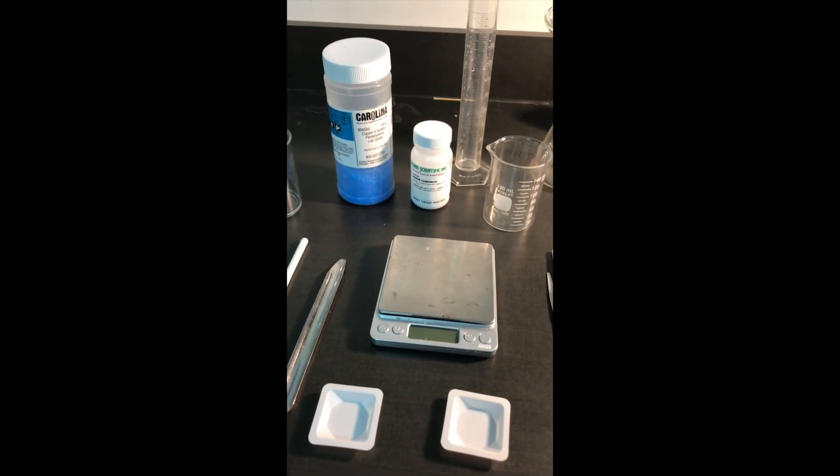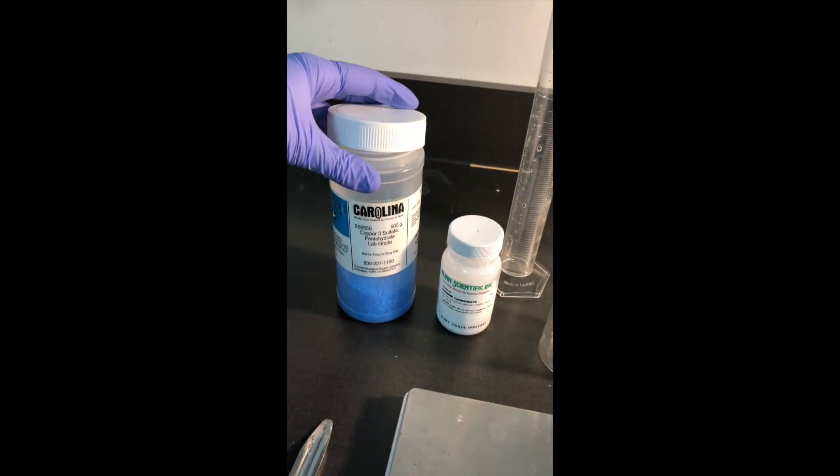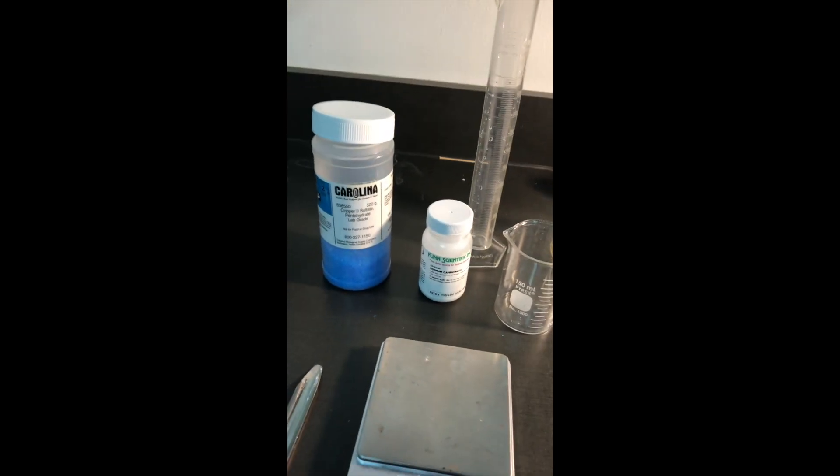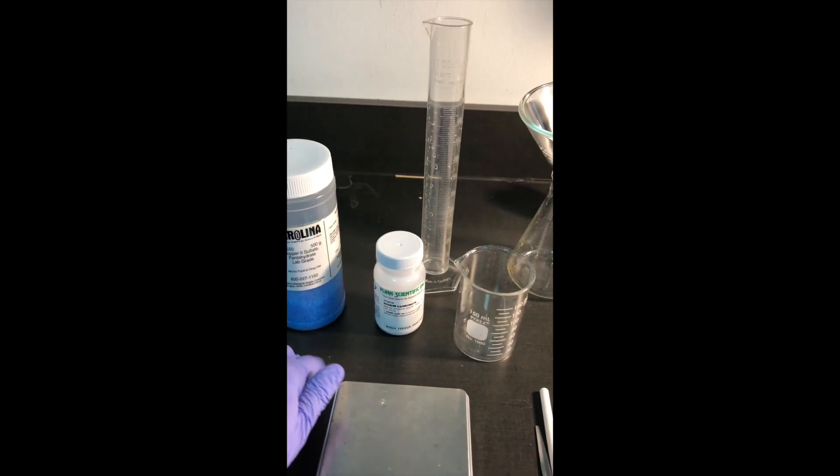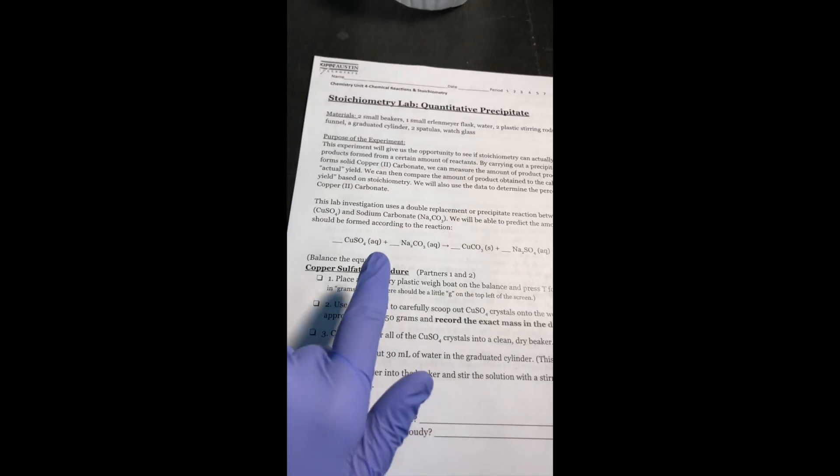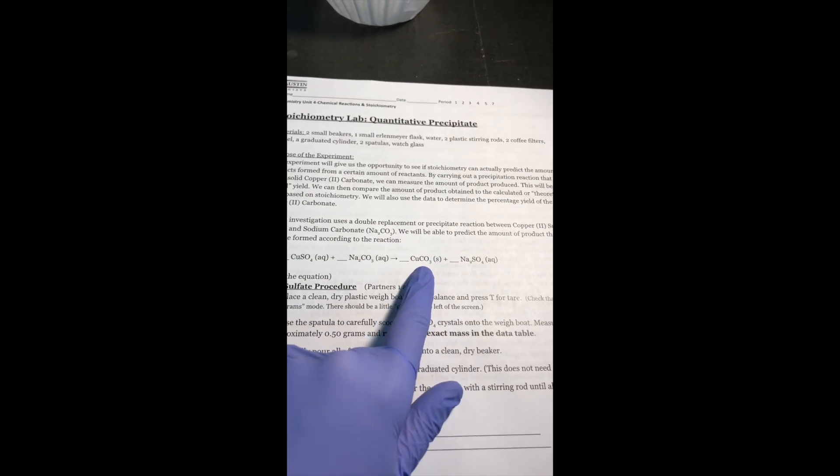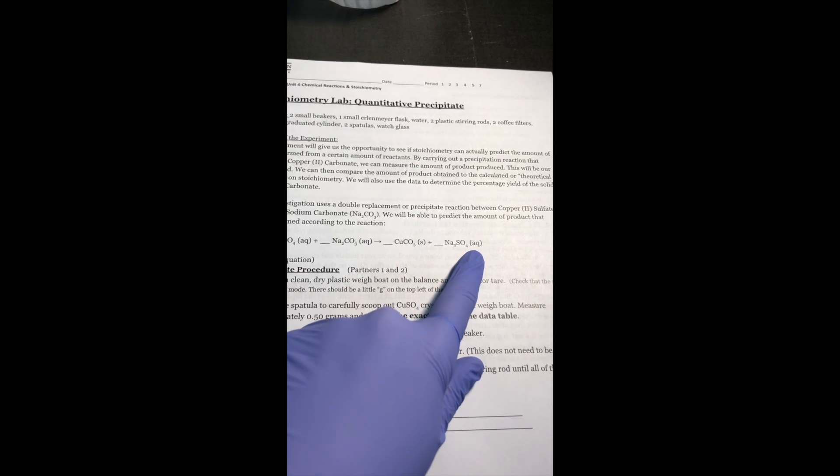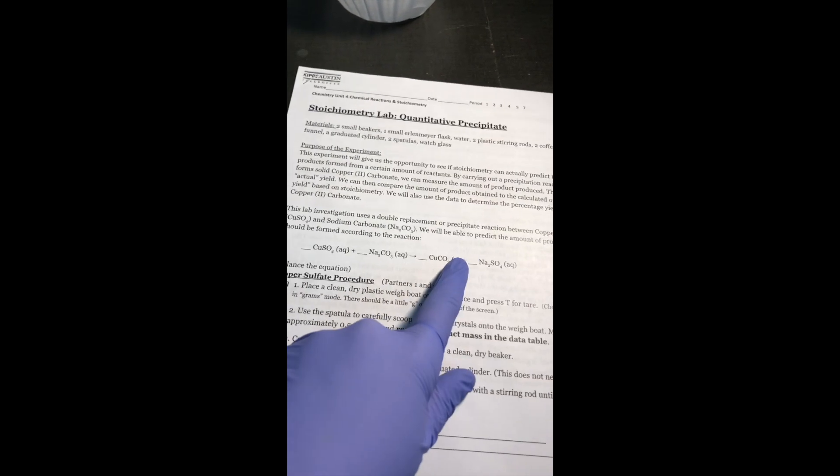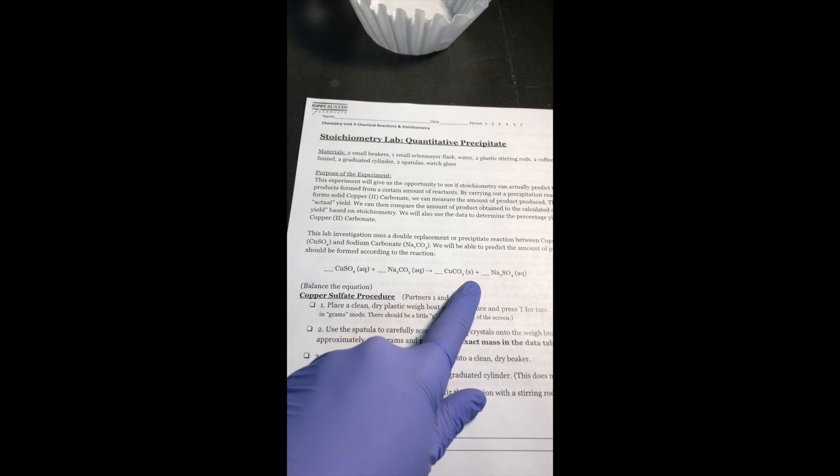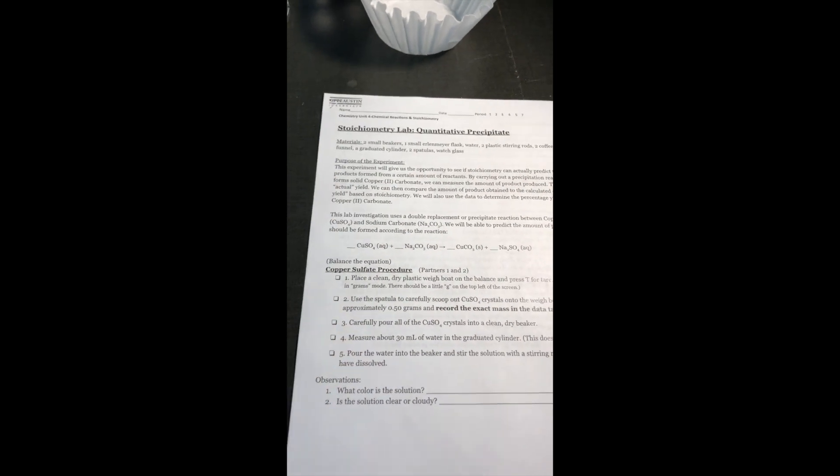We're going to do a double replacement reaction with copper sulfate and sodium carbonate. We're going to make two solutions of these crystals, stir together those solutions and make some products. The products will be, according to my chemical equation, copper carbonate, which will be solid, and sodium sulfate, which will be aqueous or in solution. What we're going to look for is that solid copper carbonate product. We're going to dry it out and see how much of it we made.